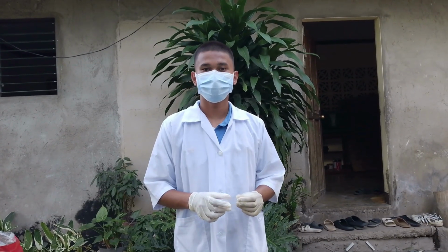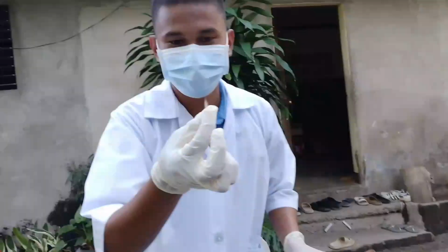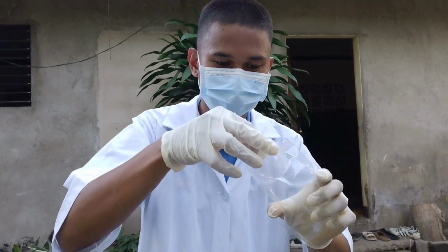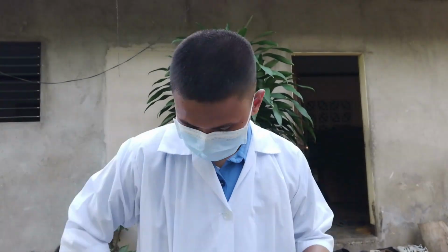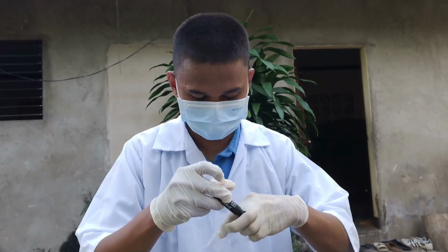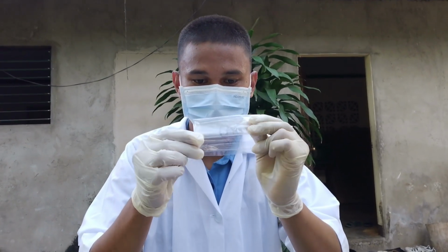The second animal hair is the cat. I have here the cat hair, so I will put it in the plastic.